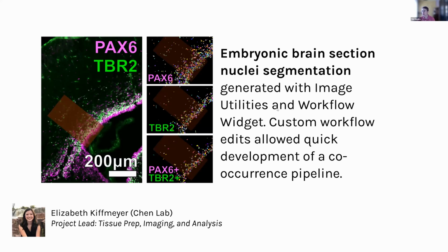I'm now just going to show you a few examples of what this plugin has powered. Elizabeth, the graduate student that I mentioned earlier, has been wanting to count the number of cells in a specific region of the brain. This is actually work that I did in graduate school, and I can tell you how much progress I've made on this compared to what was possible for me in ImageJ.